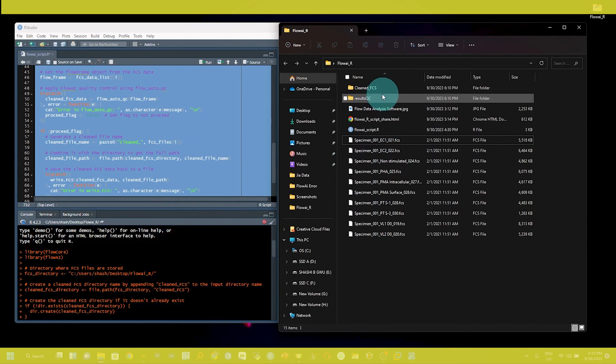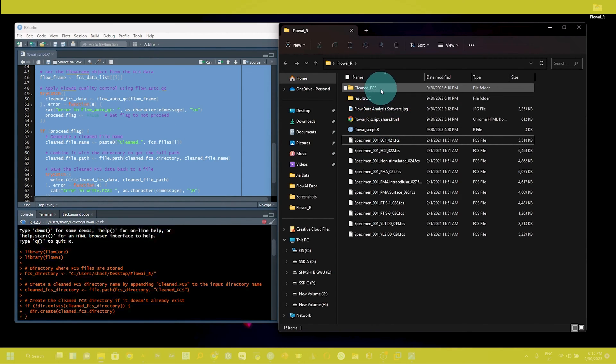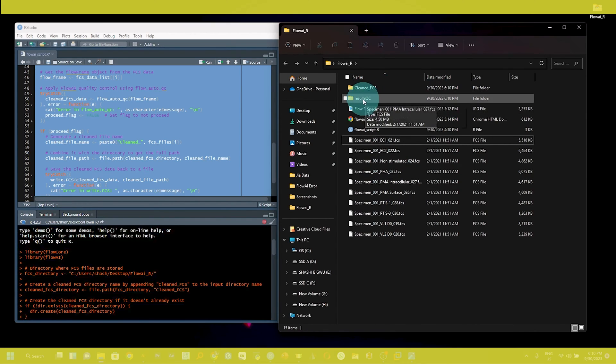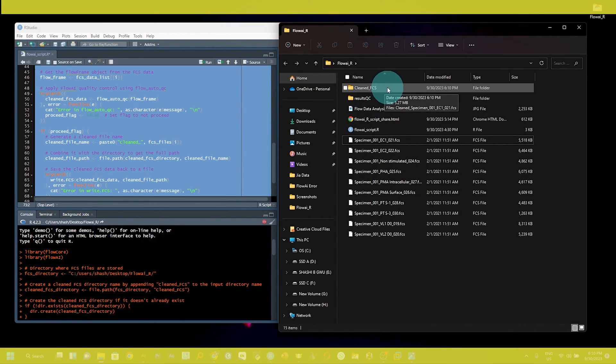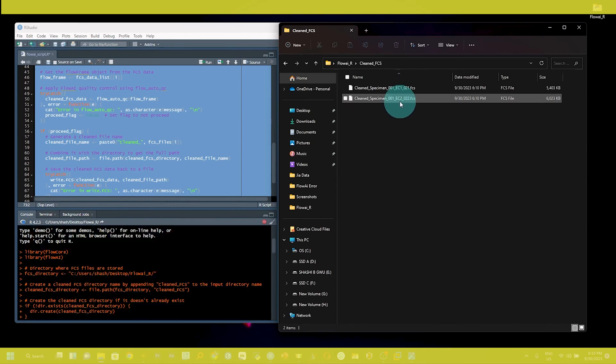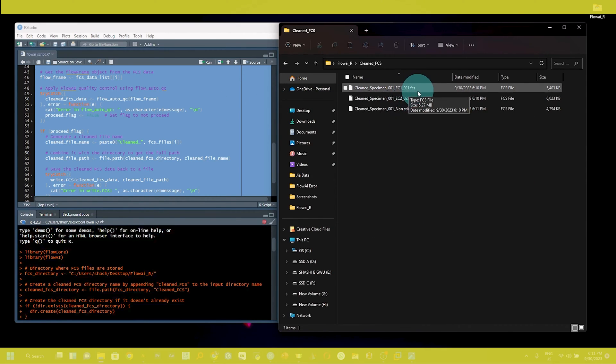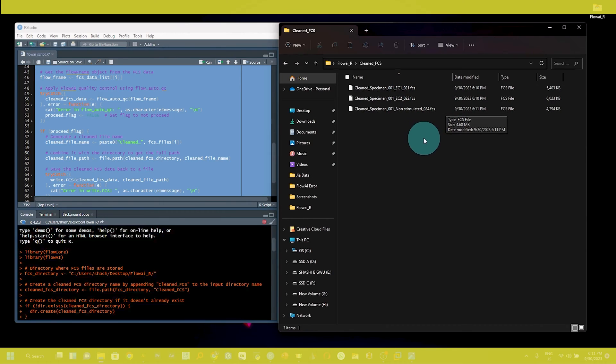Here you can see this script makes the folder "clean fcs file" and the other folder "result qc". If you click here, you can see the output of this script. We are getting the clean fcs files.